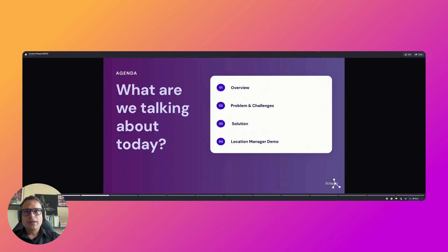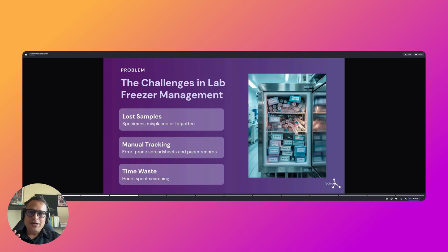First of all, imagine that you are managing a lab and you have certain problems and challenges. So I will talk about those challenges first. Then I will go right into the solution and then do a brief demo of the location manager as well. Okay, let's get right into it. So let's say your name is Dr. Maya and you are struggling to manage your freezer management or sample management.